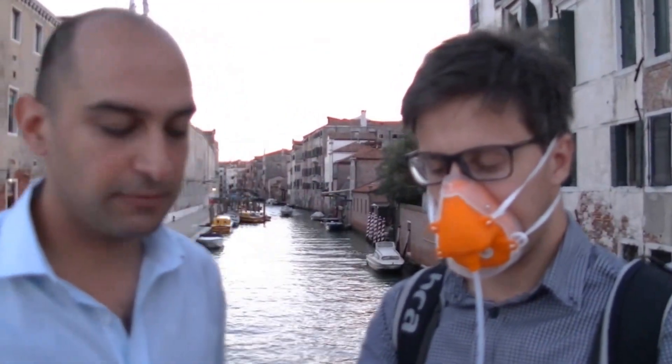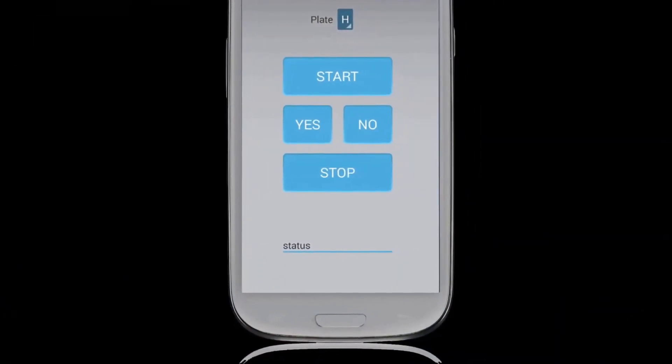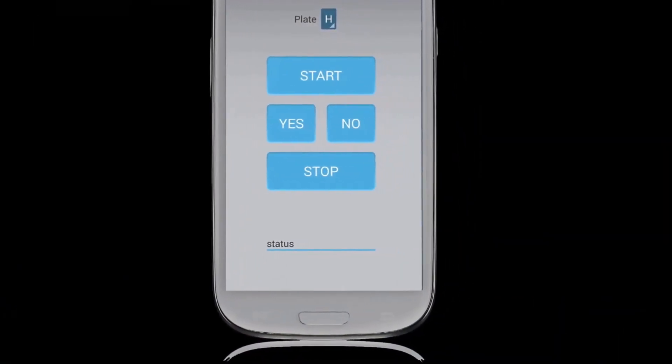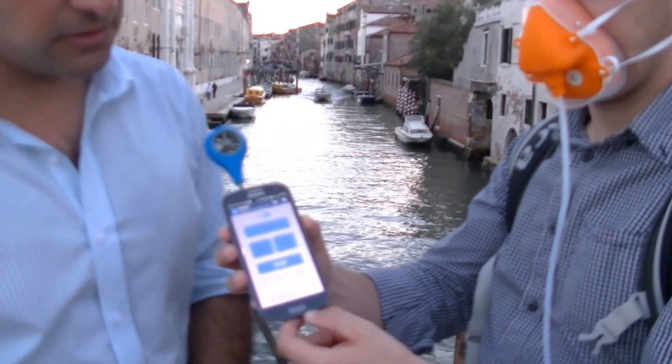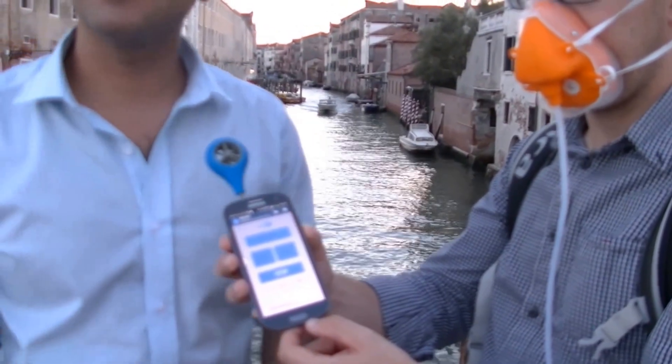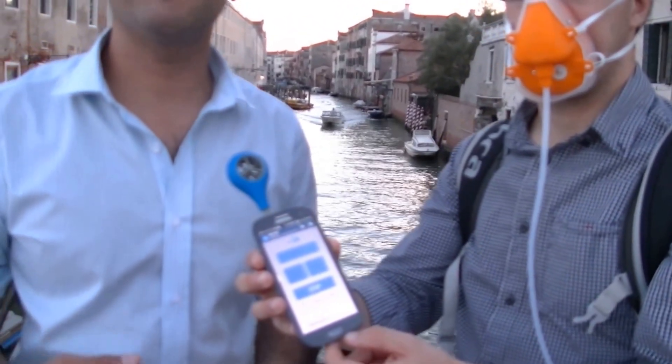When Giga starts the test by clicking start, the unit will begin by giving him 30 seconds of fresh air to re-sensitize the nose from the ambient odors present. We just wait for the status bar to go all the way to zero, and then the test will begin. Once the test starts, he will be administered different levels of odor and has to answer if he smells it or not.